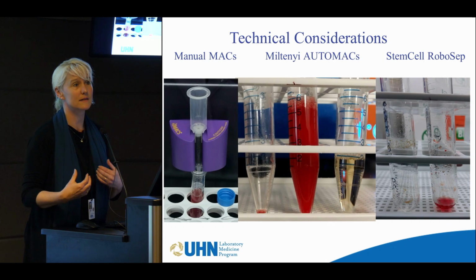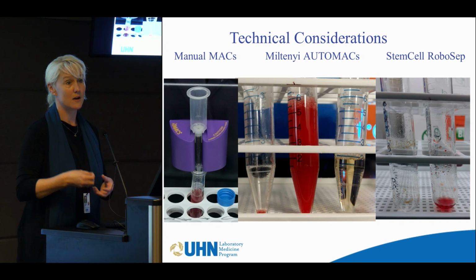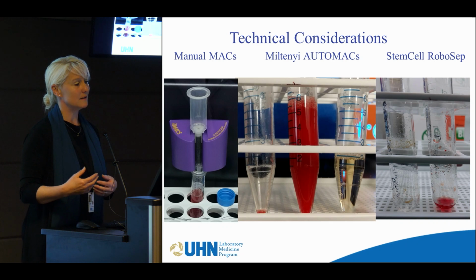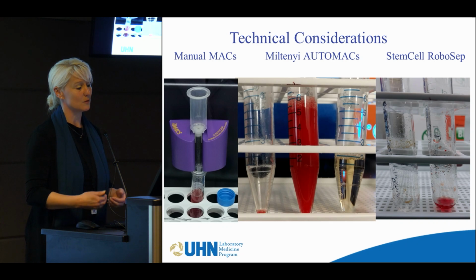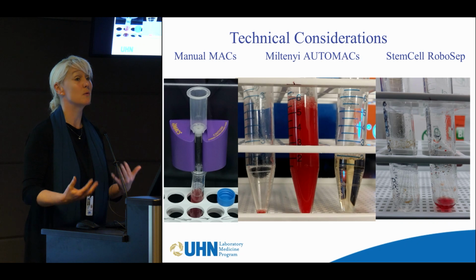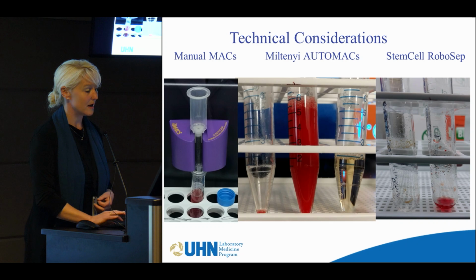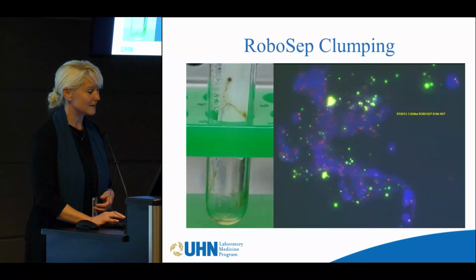All these little techniques that we do manually, we know to do that, to limit loss of cells. But these weren't initially programmed within these systems. But working with them, we were able to substantially improve the result.